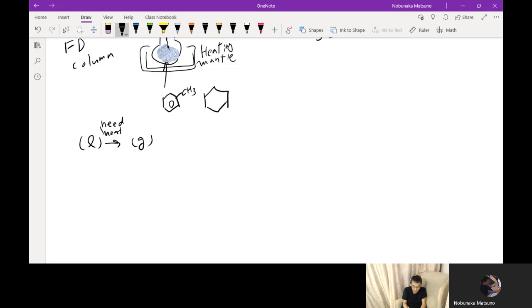You need heat for this to happen, right? So this means this is an endothermic process, because you need heat for the reaction to take place.